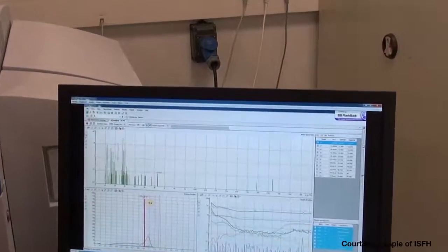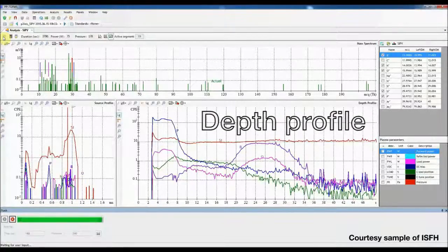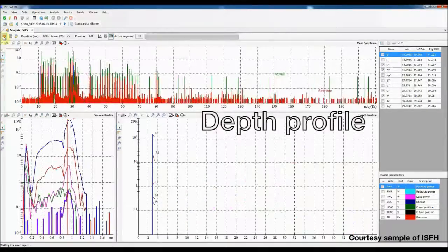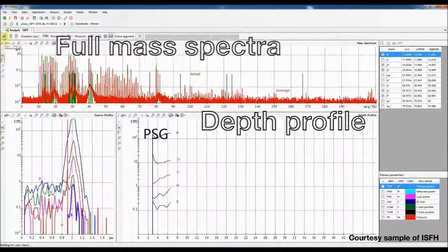Now, analysis can start. The depth profile can be seen in real time in the bottom right window, while the top window shows the full mass spectrum.